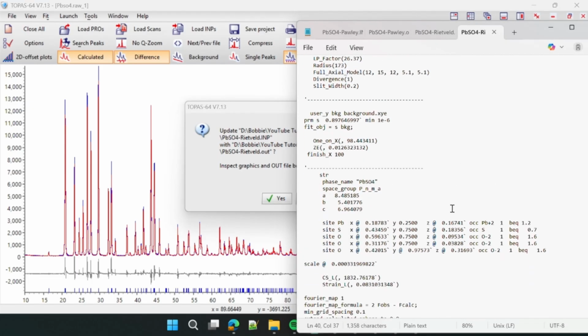And then let's check these. That's fine. That's fine. That's fine. That's okay. That's fine.